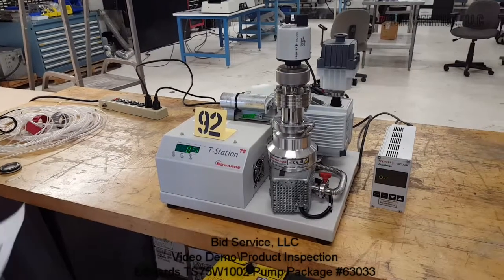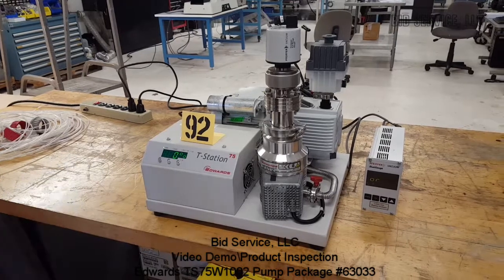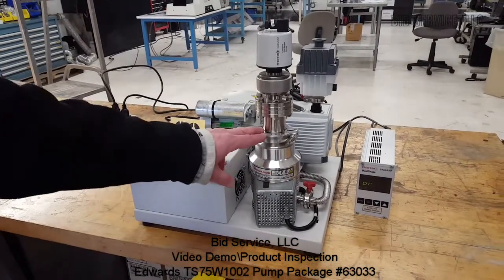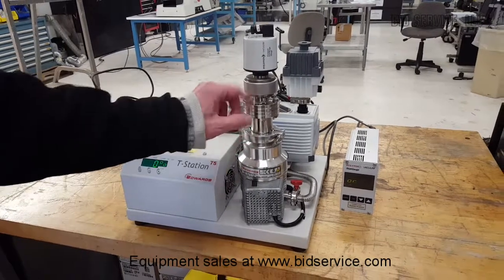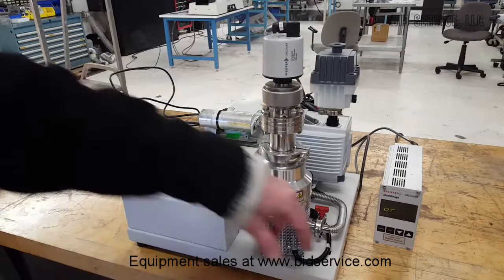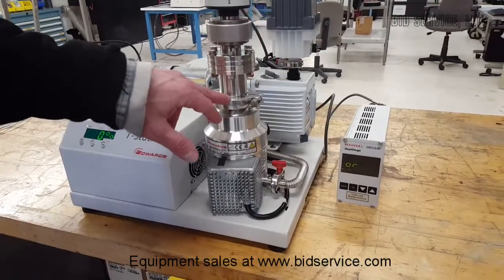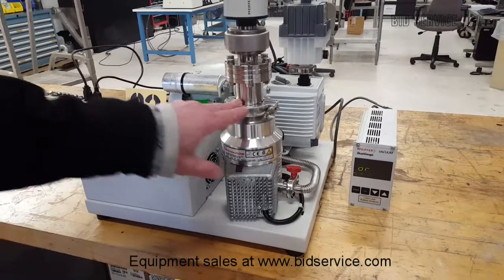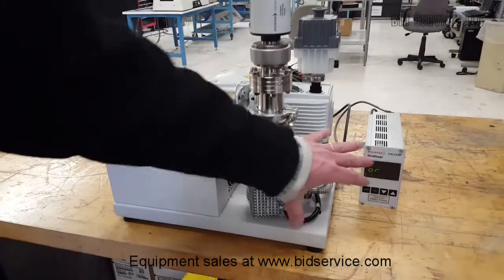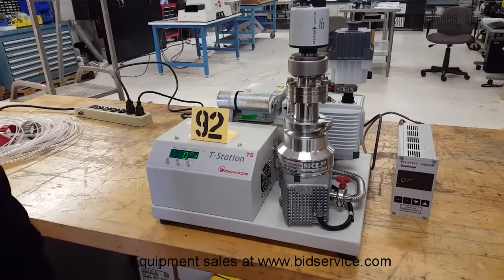This is the Edwards TS-75W-1002, the T-Station 75. I've put one of our house gauges here, the Pfeiffer PK-261, to show you what the vacuum is right here at this port — that's a KF-40 port. The gauge does not come with the unit; this is just a house gauge we're using to demonstrate that the turbo pump is operating properly.